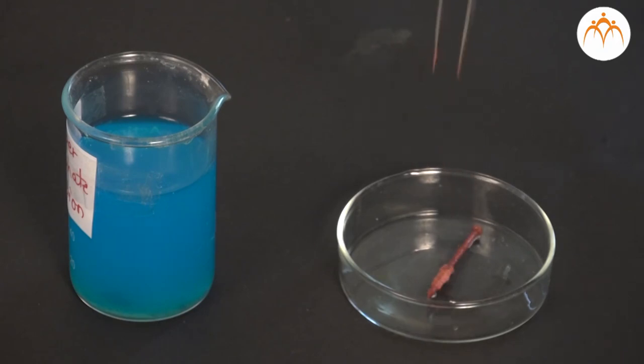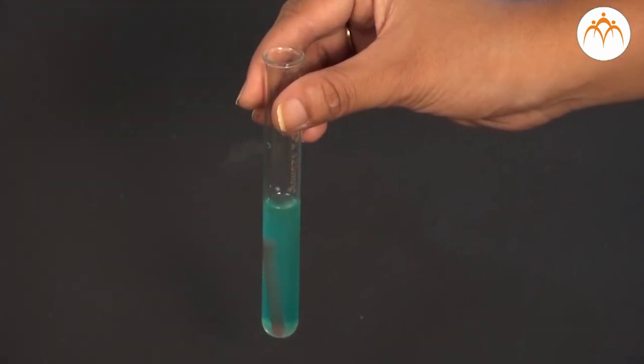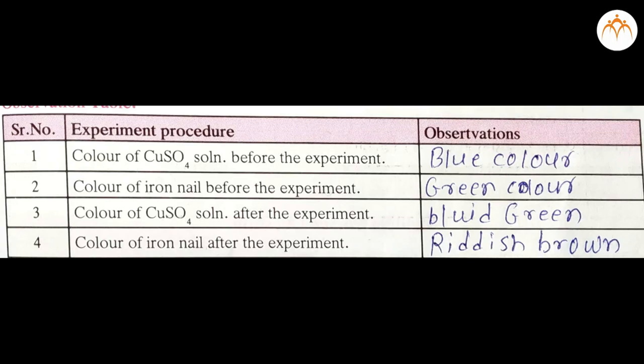Before the reaction, its colour was steel grey. After reaction, it becomes reddish brown as copper is deposited and solution becomes light green after iron displaces copper. This is an example of displacement reaction.